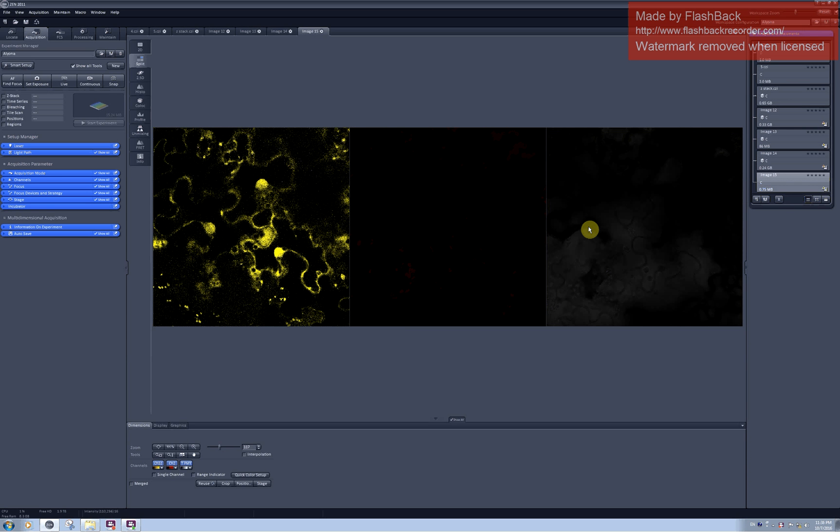Photobleaching is a very handy tool with a lot of cool applications. For example, it allows you to estimate the motility of your fluorophore in your sample.